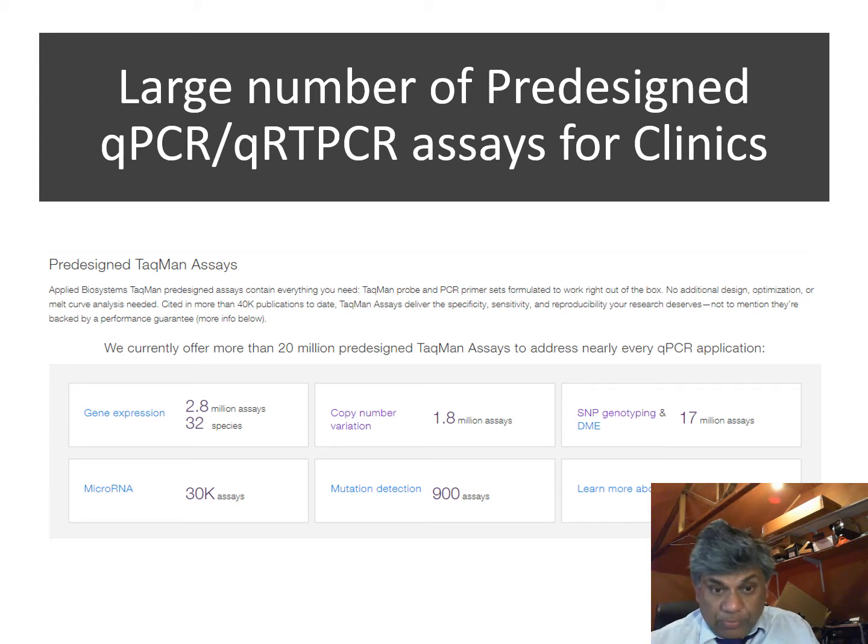As I explained to you before, in a clinical lab, you need to have pre-tested assays, and of course, when you've got patient DNA samples, you can buy the established tests. There are actually 17 million SNP assays that you could buy from this company, for example. There are 1.8 million assays for copy number and 900 assays for mutation detection. So, these are all ready to go solutions.